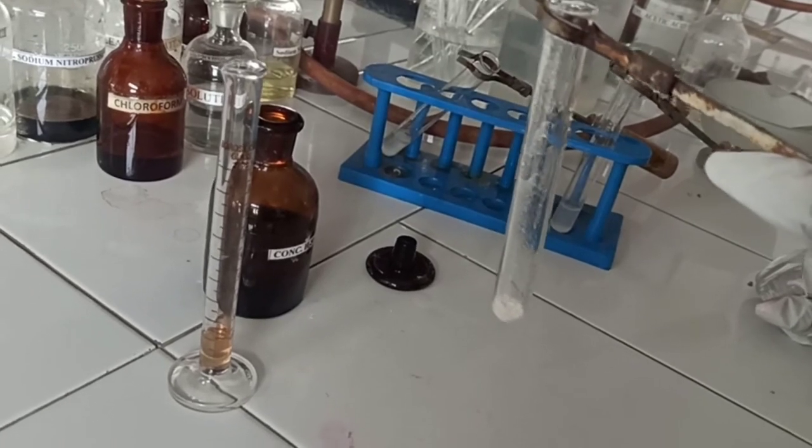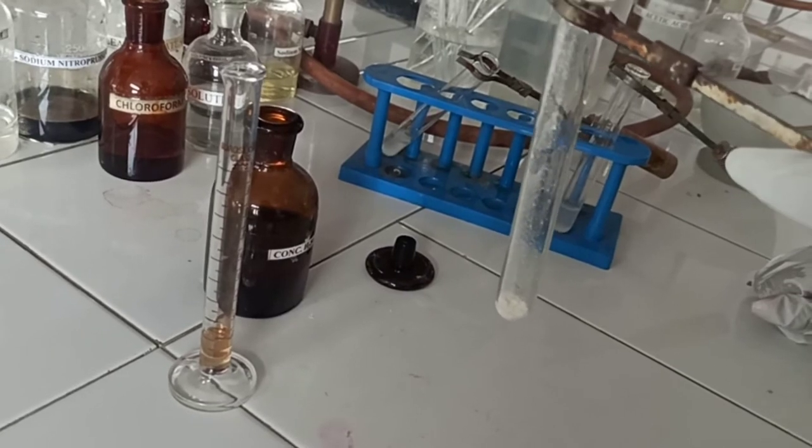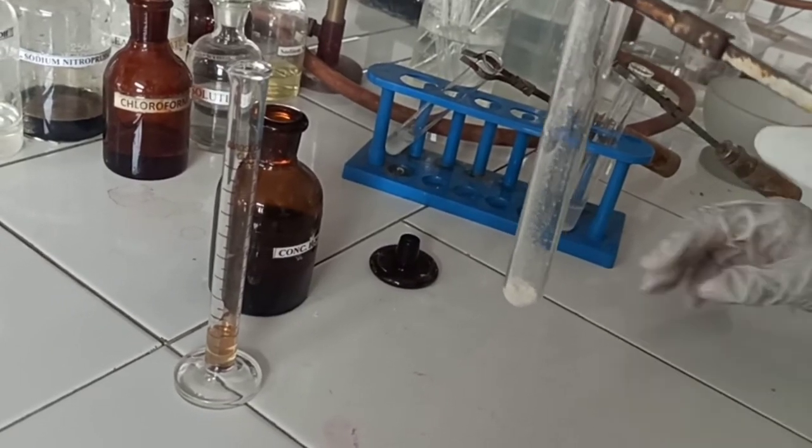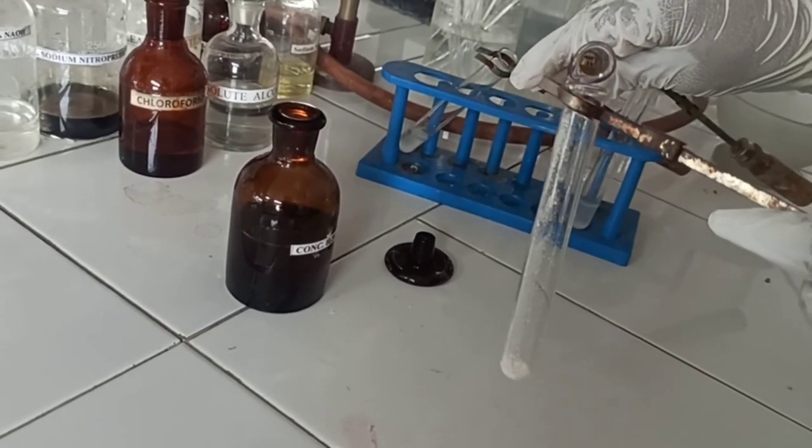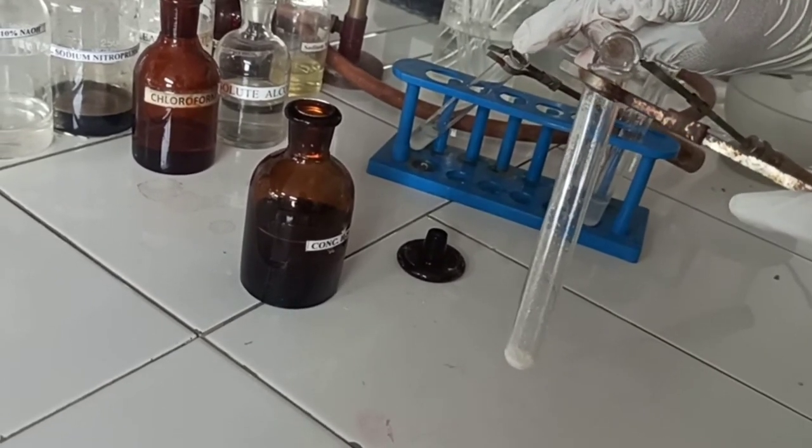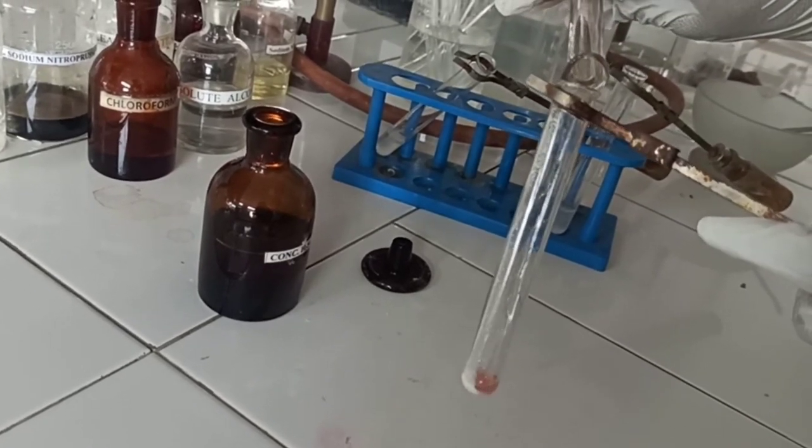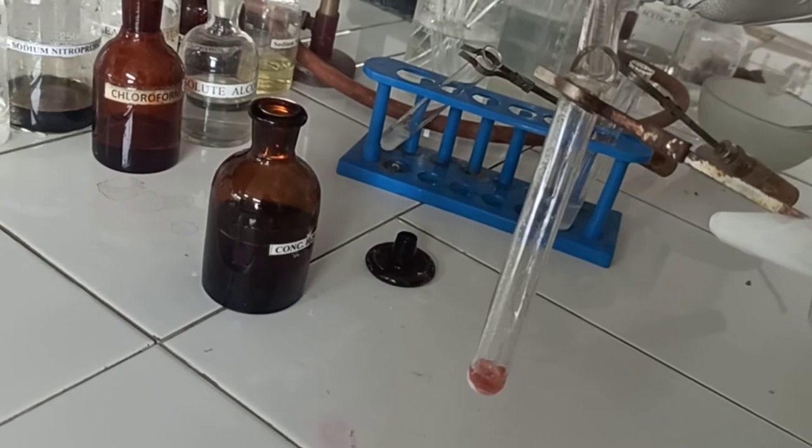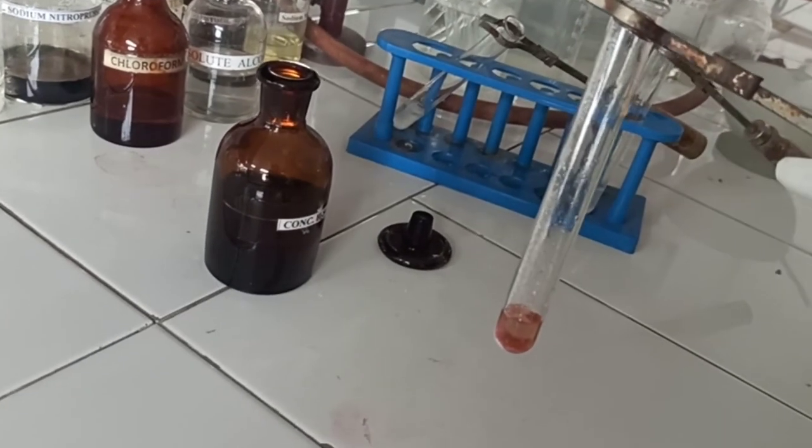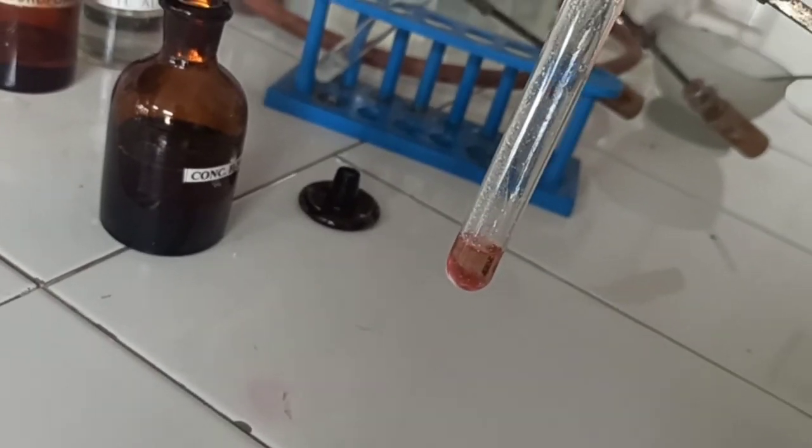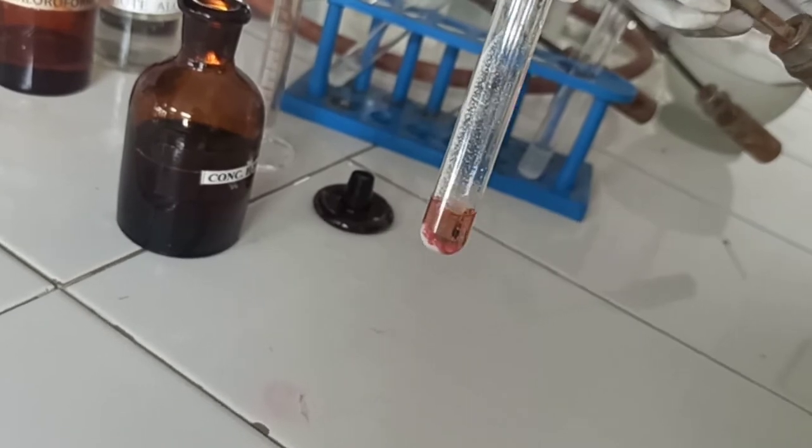Test A: We have to take 2 mg of drug and we have to add 1 ml of sulfuric acid in that. Then we have to stand it for 5 minutes. So we added sulfuric acid. See we get a red color which is already produced. So we get a red color when adding sulfuric acid to our drug.